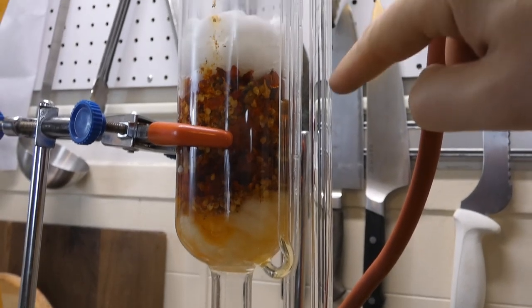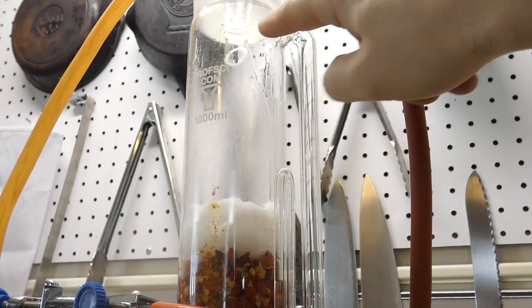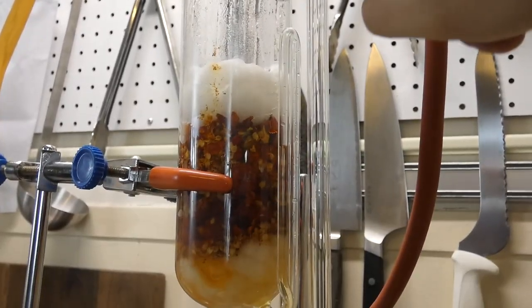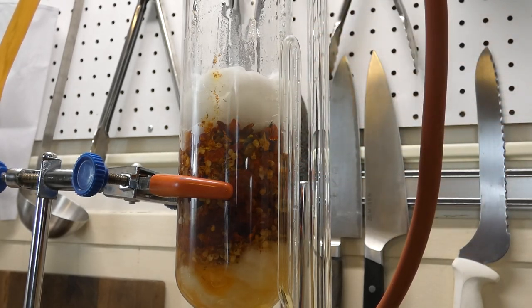They're gonna start condensing up here. As you can see, there is some drippage coming off of the spout coming from the condenser up top. That's dripping down onto this, and this will slowly start rising. And we'll come back when that happens.